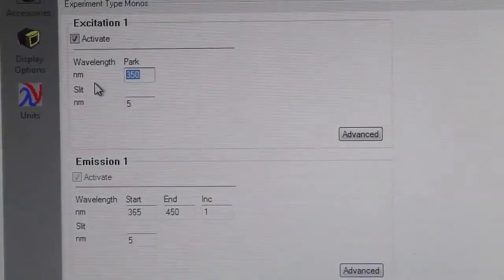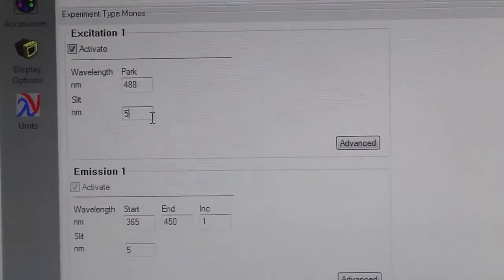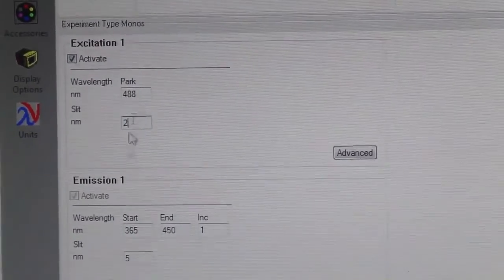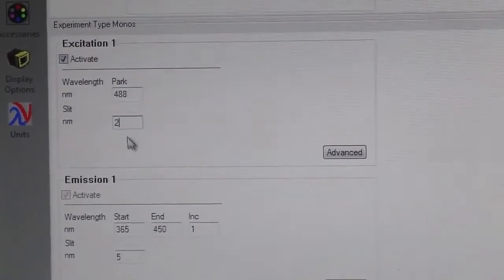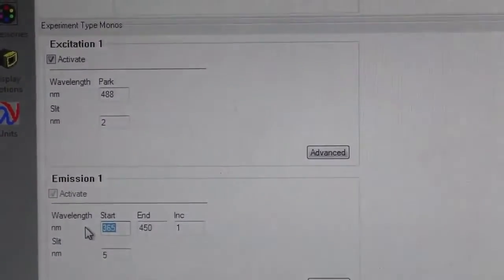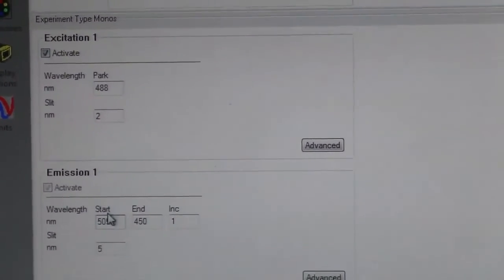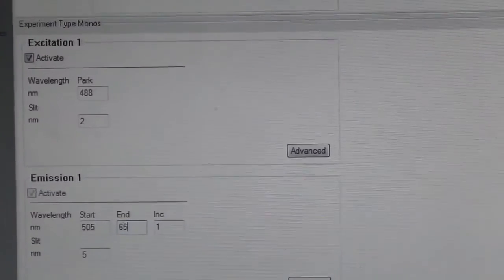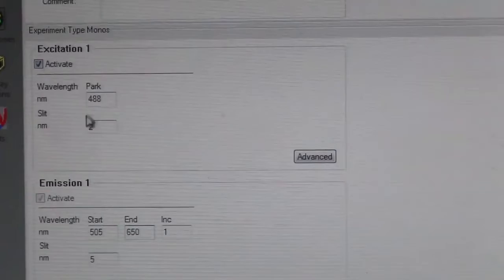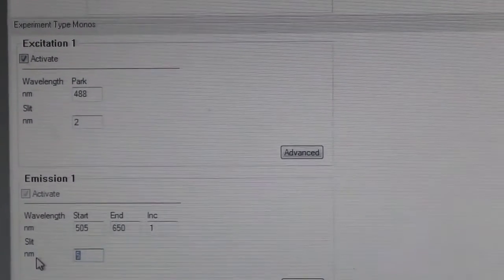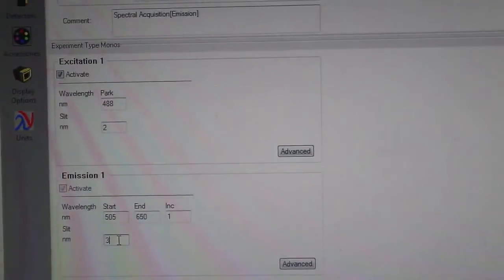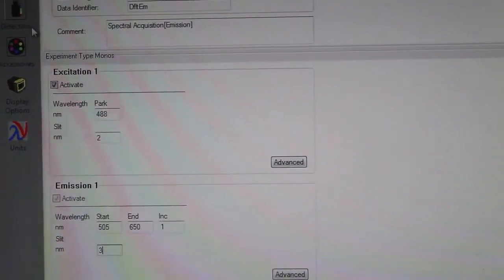Alexa Fluor 488 excites at 488 nanometer wavelength. We change the excitation slit to 2 nanometers. This excitation slit depends on how much fluorophore concentration you have in your sample. We collect the fluorescence emission from around 505 nanometers to almost 650 nanometers. This should span the range of emission for both the donor and the acceptor. We keep the emission slit width a little higher compared to the excitation slit width. That gives better sensitivity.